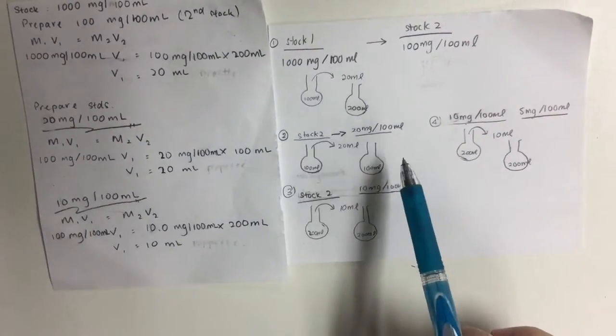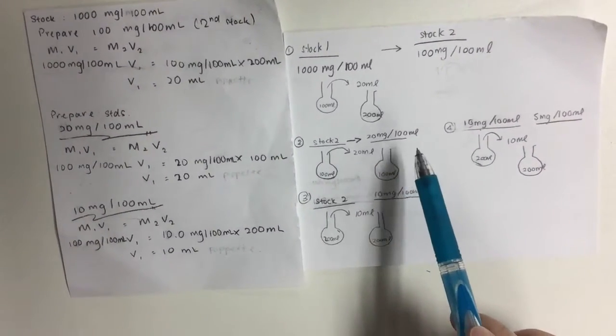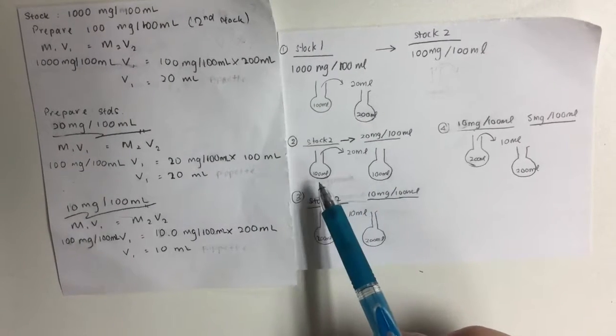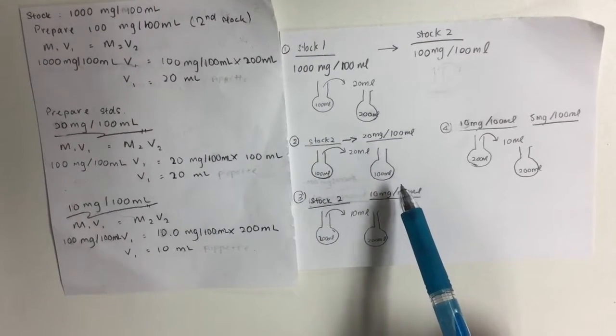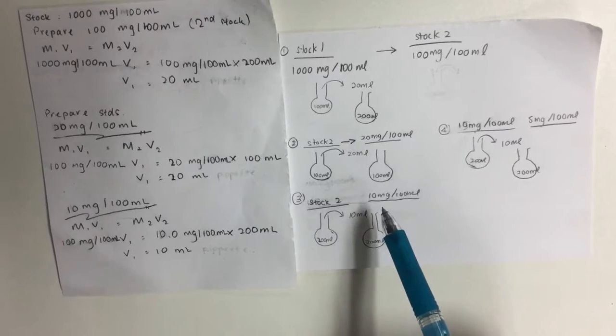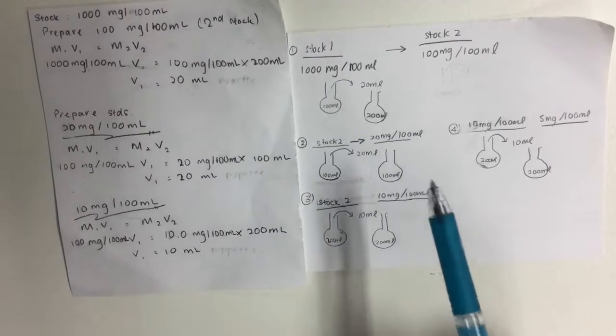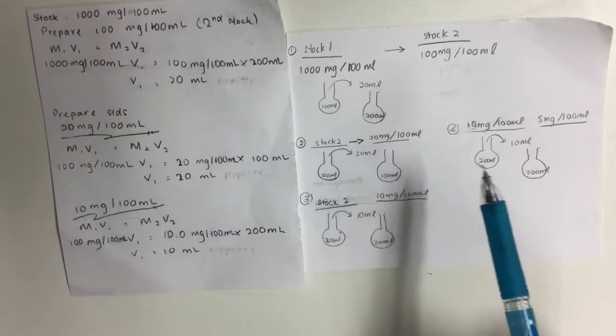To prepare our standard of 20 mg per 100 ml, we'll take 20 ml from stock 2 into a 100 ml volumetric flask and fill up the volumetric flask, and it becomes our 20 mg per 100 ml.